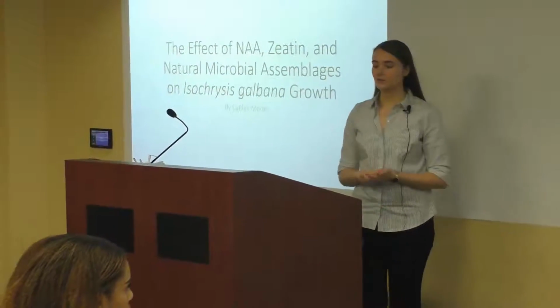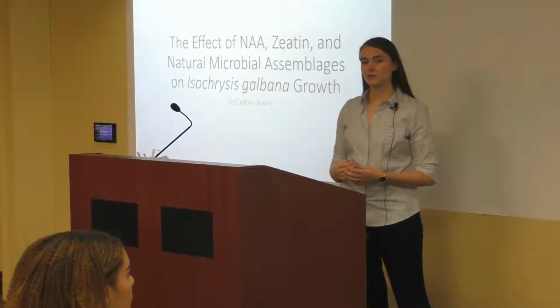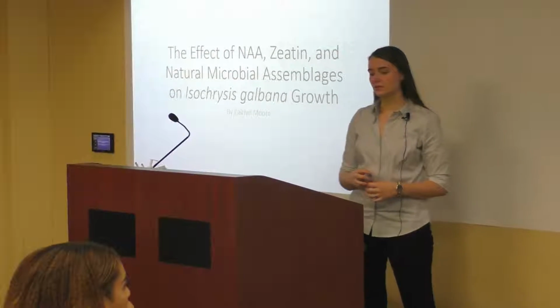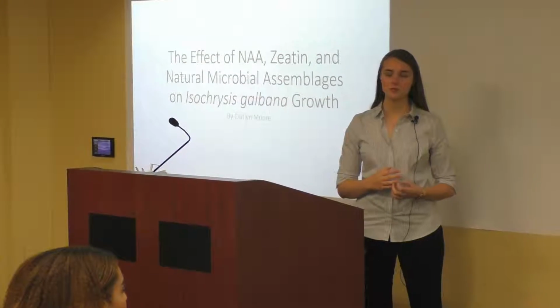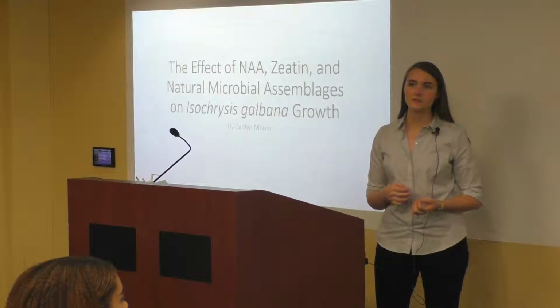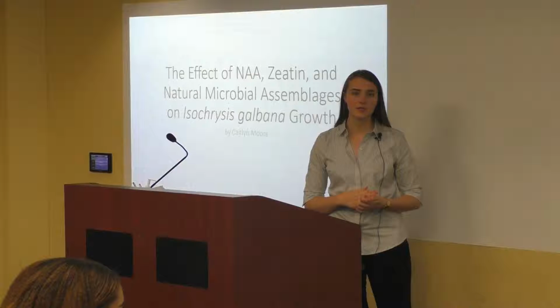Hi, I'm Caitlynn. My internship was at the Aquatic Germplasm and Genetic Resource Center. My mentors were Dr. Tiersch and Dr. Gutierrez-Wing, and I was tasked with developing and conducting my own research project. And this is what I came up with. It's the effect of NAA, zeatin, and natural microbial assemblages on Isochrysis galbana growth.